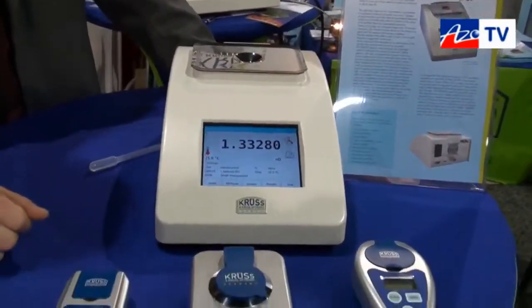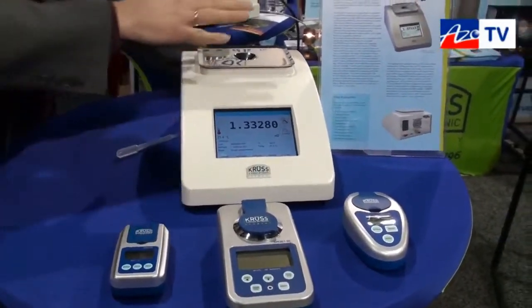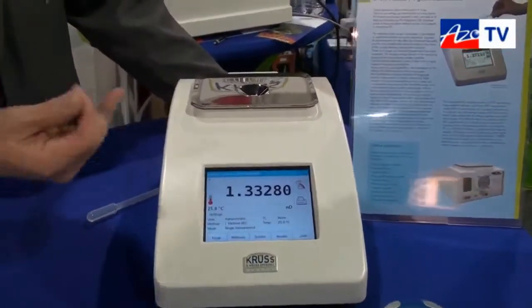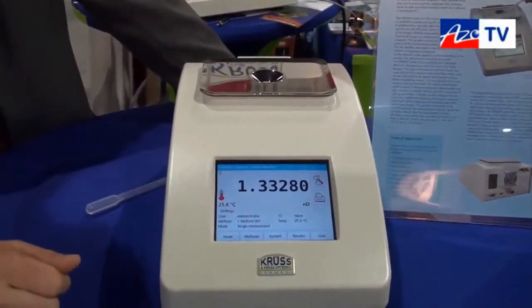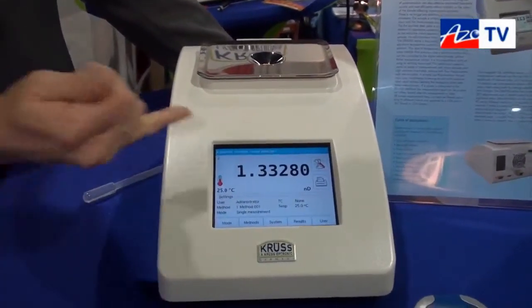It's part of our refractometer range. We also have small handheld refractometers. The benchtop model DR6000 is available in different accuracies — with five digits or four digits for the refractive index.